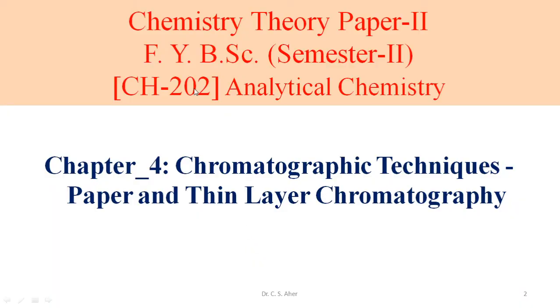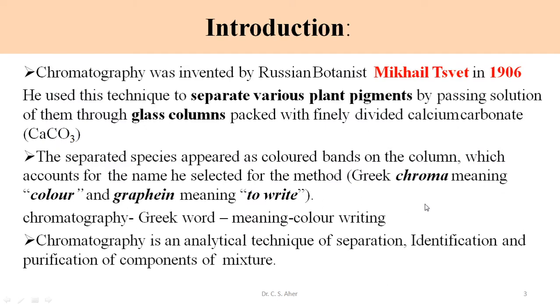So today we have considered the fourth chapter of the second semester of analytical chemistry. The name is chromatographic techniques. In this chapter we have considered two techniques, that is paper and thin layer chromatography. So what is this chromatography?